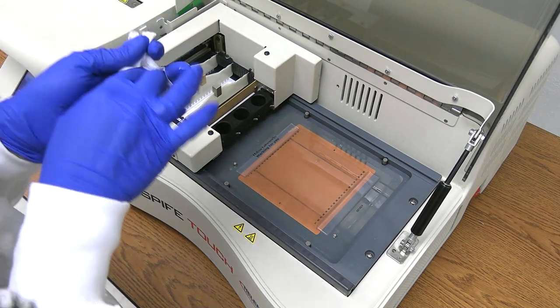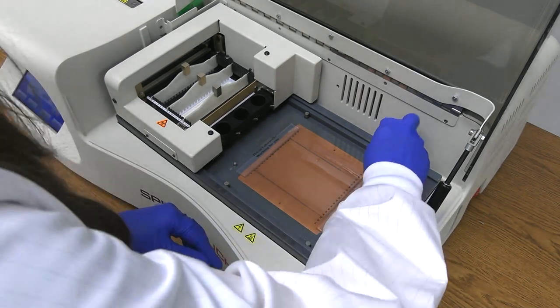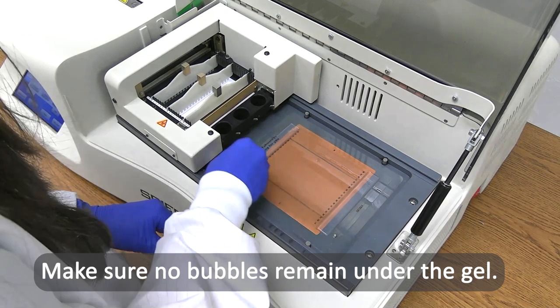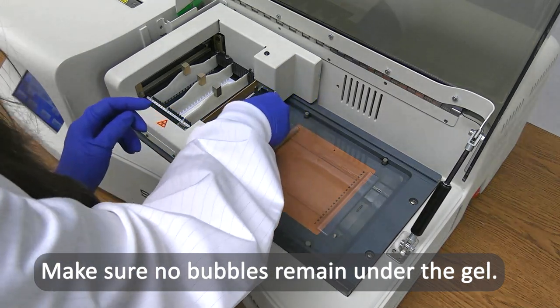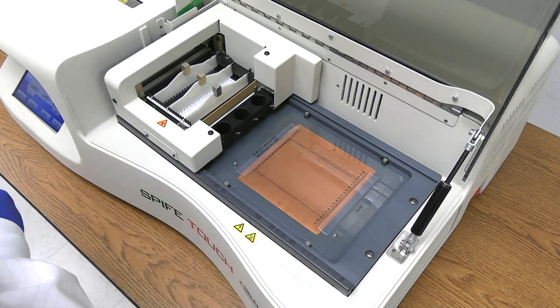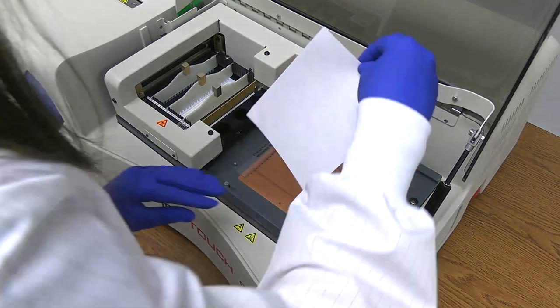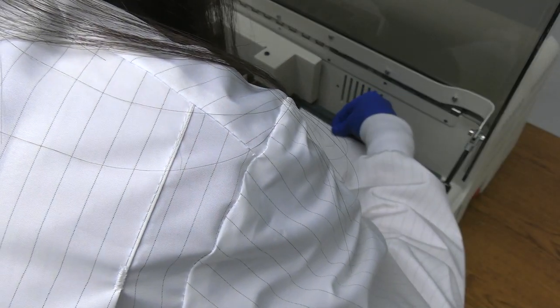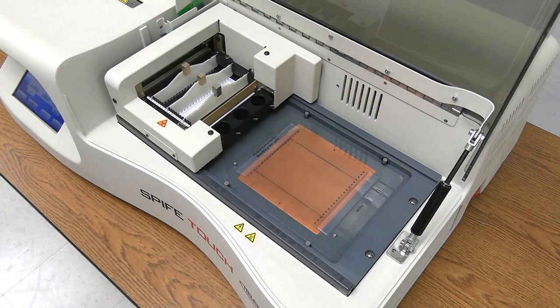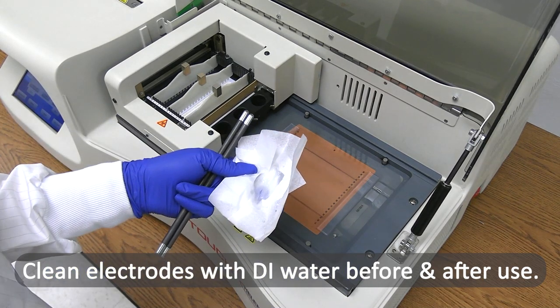Use lint-free tissue to wipe around the edges of the plastic gel backing, especially next to the electrode posts, to remove excess prep. Make sure no bubbles remain under the gel. Place a SPIFE blotter C on the gel with the longer edge parallel with the gel blocks. Gently blot the entire surface of the gel using slight fingertip pressure. Remove the blotter.